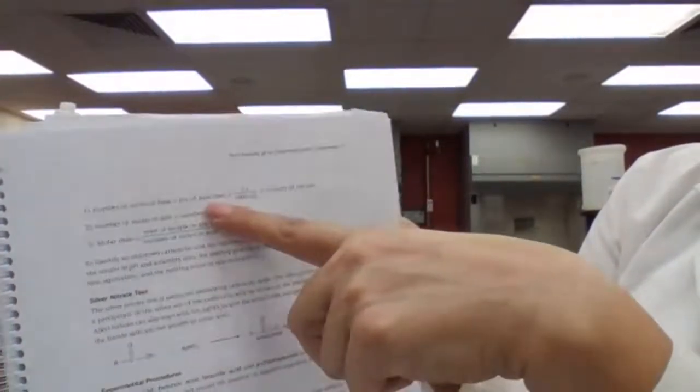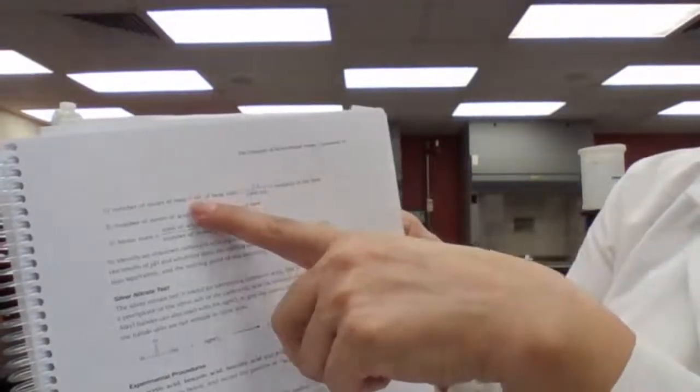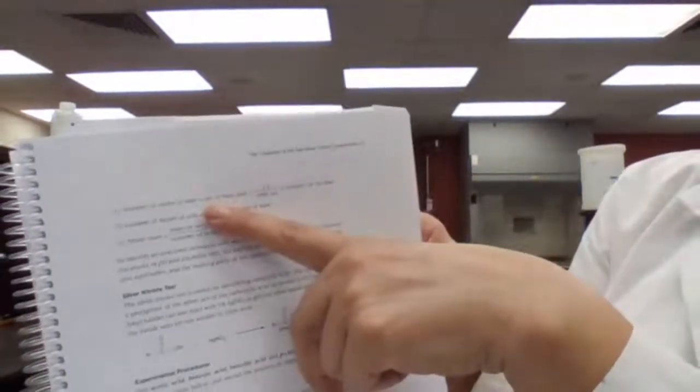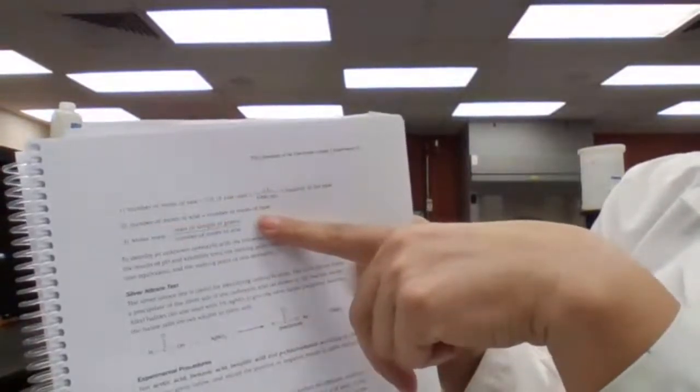It shows how to calculate the molar mass. So first you're going to find number of moles of the base, which is the milliliter of the base times the concentration of the base. So concentration times volume in liter, that would give you number of moles of the base used. Number of moles of the base equal to number of moles of the acid.